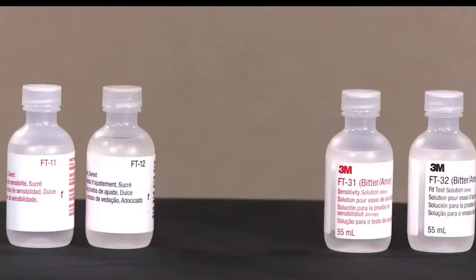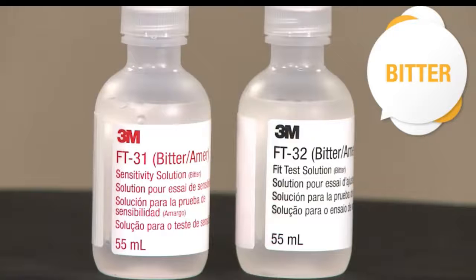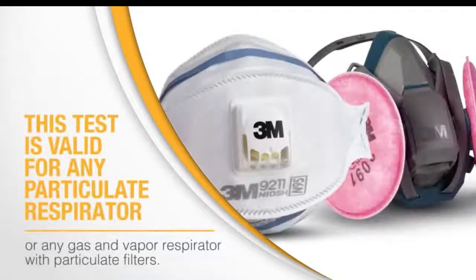One type of qualitative fit test can be performed with a mist that contains either saccharin, which is a sweetener, or a bitter-tasting substance known as Bitrex. The test process is the same for both test agents. Your instructor will tell you which material will be used for your fit test. This test is valid for any particulate respirator or any gas and vapor respirator with particulate filters. The particulate filters are used so that only facepiece fit is tested.